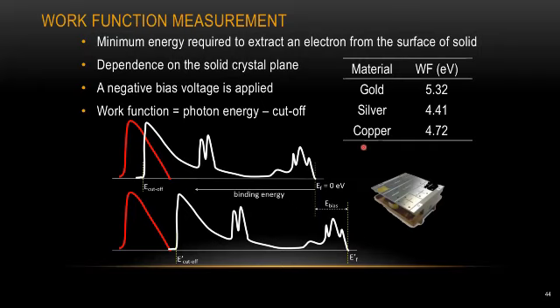The data on top here are just some normal survey scan. Usually, if you're working on some metallic sample, we treat your Fermi level as sitting somewhere around 0 binding energy here. In order to do the work function measurement, we need to know the high binding energy cutoff energy right here. But most of the time, you won't be able to observe this edge because it's being overshadowed by the spectrometer work function, the rest of the spectrum here.